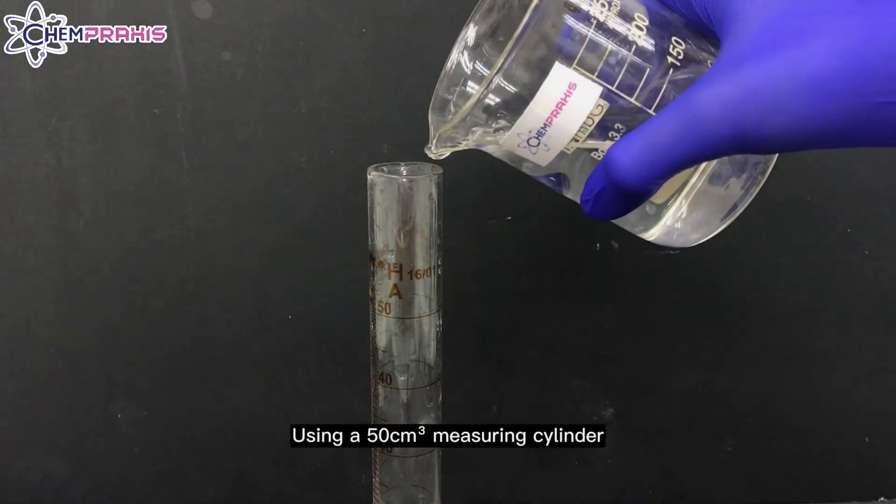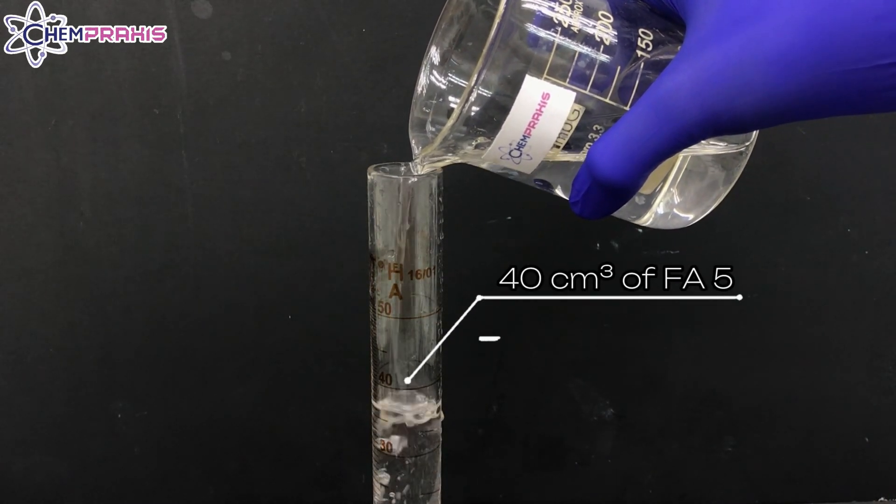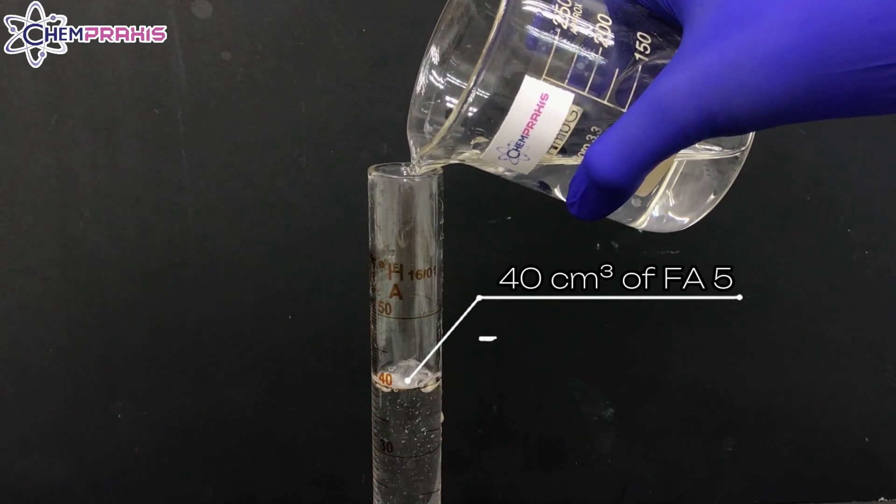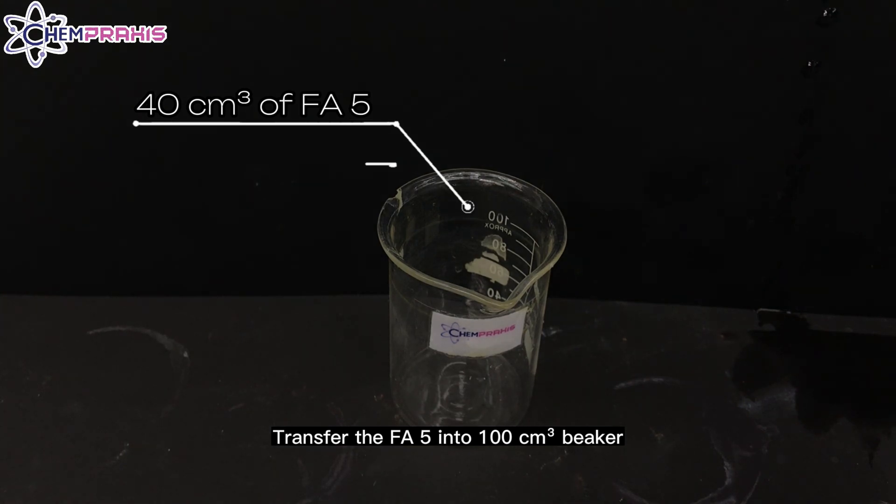Using a 50 cm³ measuring cylinder, we'll measure 40 cm³ of FA5. Transfer the FA5 into a 100 cm³ beaker.